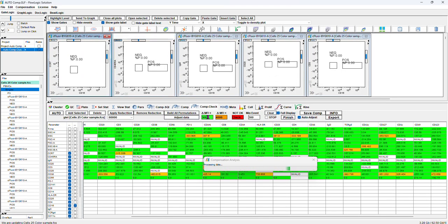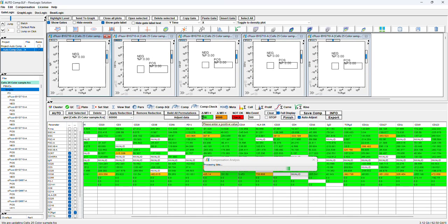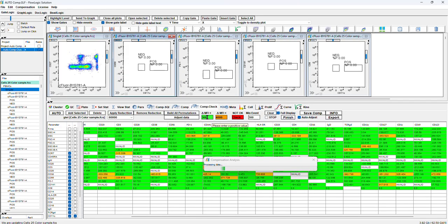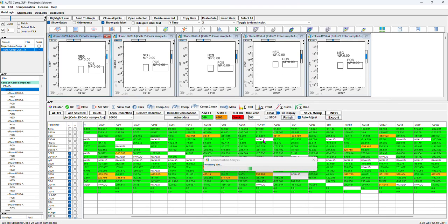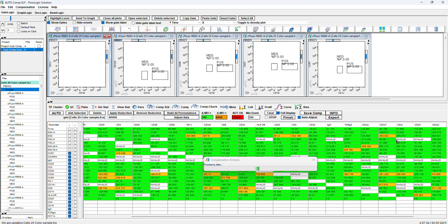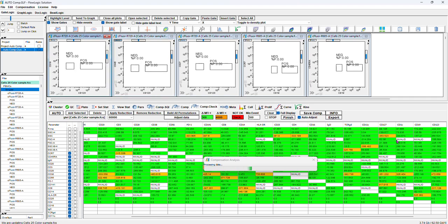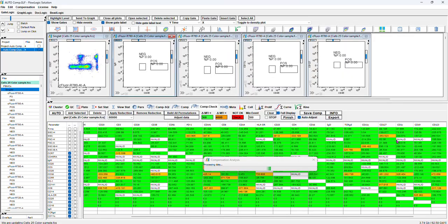Here we have again the default setting for Aurora, and we can set here whatever we want at the end. Minimum event, you can see invalid. So we have some areas where the gate doesn't get the minimum event, so we are not able to extract this event.